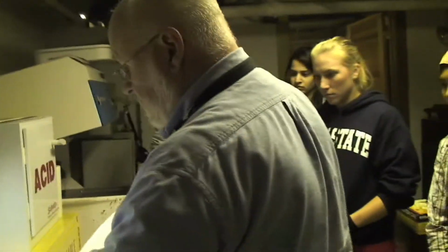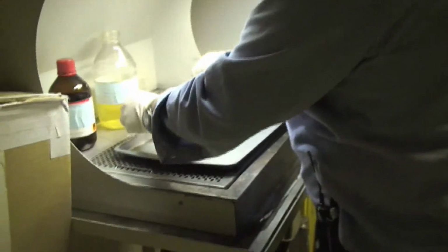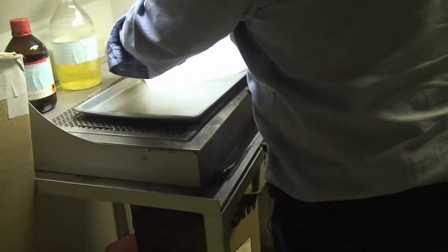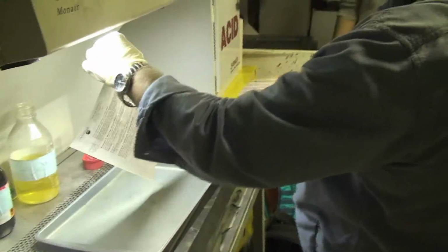What we're going to do is pour a small amount into the tray. Now normally you want to keep the DFO reagent in a dark container like this, but since we use it up very quickly in class, I don't have to worry about it. And we're going to impregnate the paper with the reagent. We're going to let it dry for a second or two.